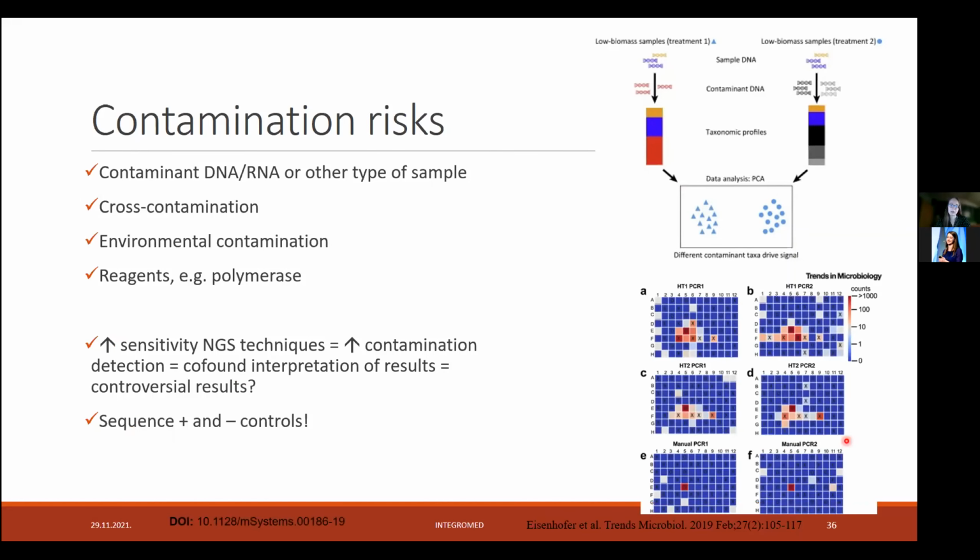And this also is quite an interesting picture showing that if we work in a plate, here, like a 96 sample plate. The red spot is where we put some specific bacteria, and this shows, if you work using automation, how far the specific bacteria have gone. So it was inserted only in one spot, in one well, but it has gone quite far. You can see it in various places of the plate. However, if we use manual work, then this contamination is actually significantly smaller.